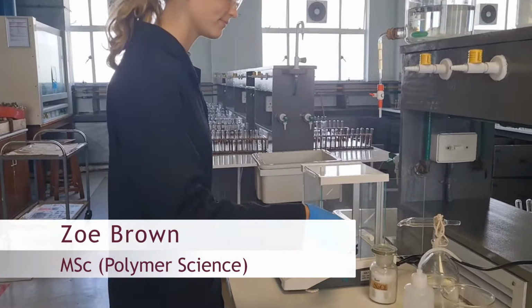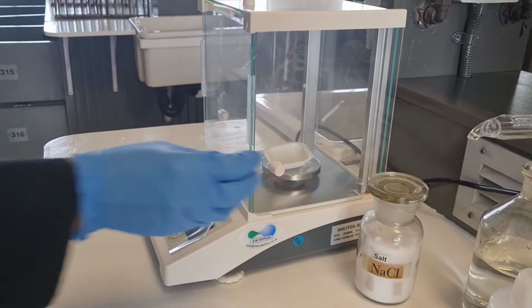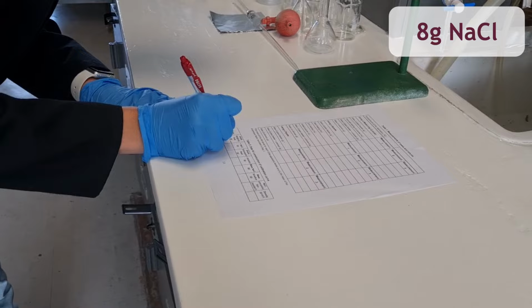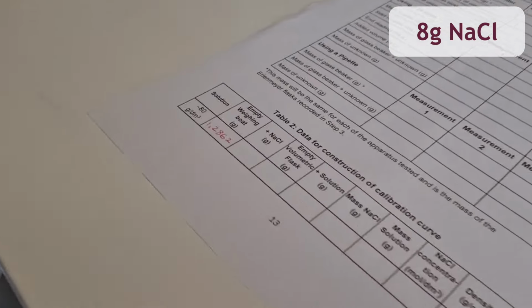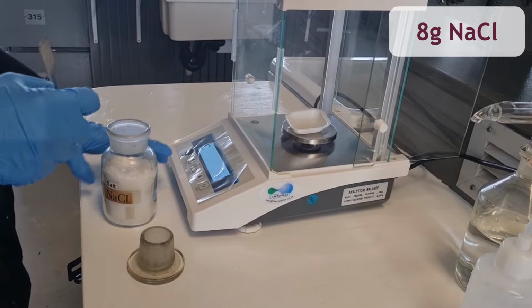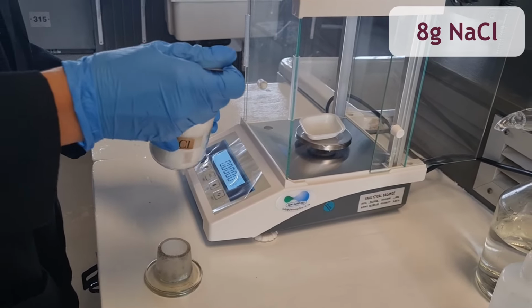Firstly, take a clean weighing boat to the balance, weigh its mass and record the mass in the table. Add about 8 grams of sodium chloride. Remember, it does not have to be 8.000 grams exactly, but it can be between 7.800 grams and 8.200 grams. Record the mass of the weighing boat and the added sodium chloride salt of about 8 grams.